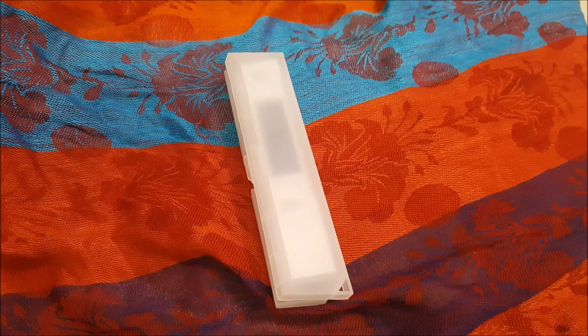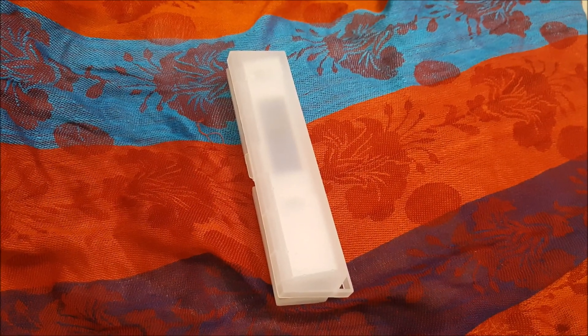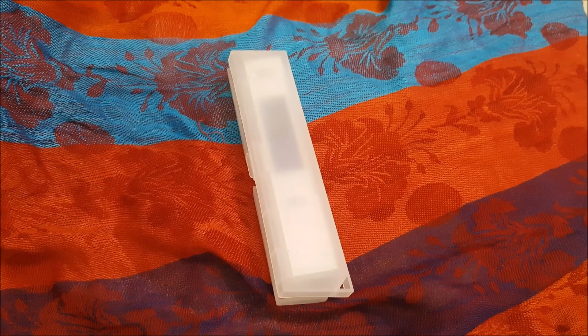Hello friends, today we will do a quick review of a TDS meter.